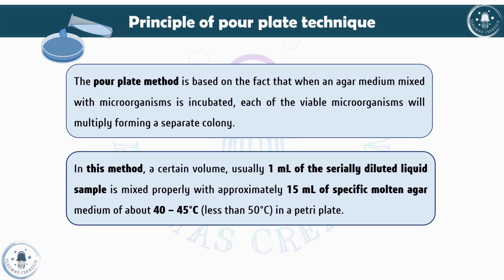This will become more clear when we look at the procedure part. Basically, the agar medium is used where the liquid sample will be mixed with the agar medium and poured in the Petri plate.